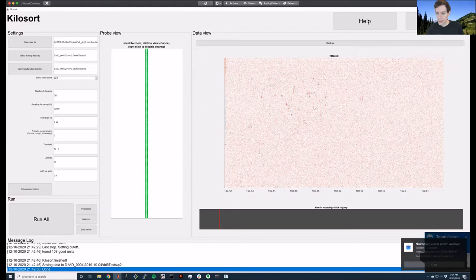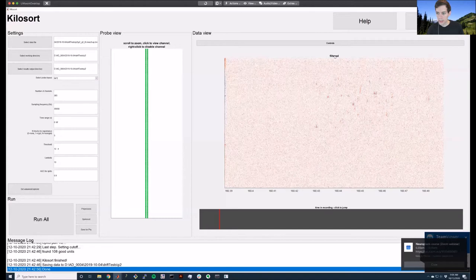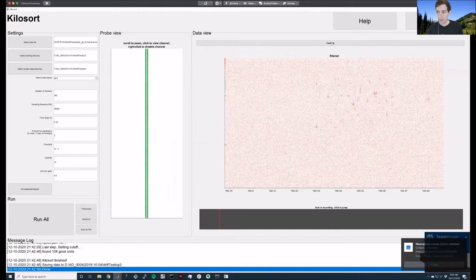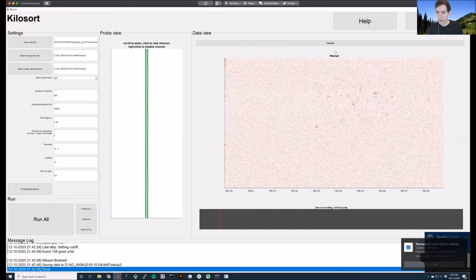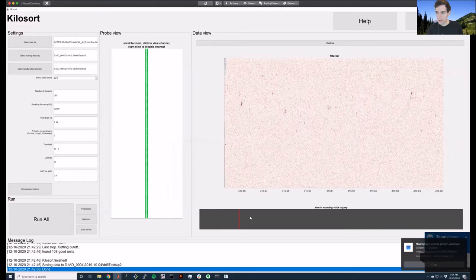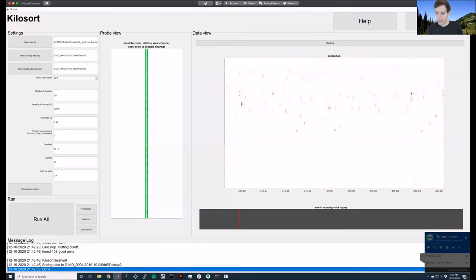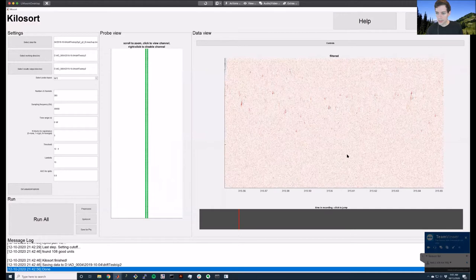You can switch back and forth between the raw data and the filtered data. From the filtered data you can see the prediction and the residual. As indicated in the controls, keys 1, 2, 3, 4 enable different data views: pressing 3 goes to prediction, pressing 2 goes back to the filter, pressing 4 goes to the residual. The bar at the bottom is a timeline — you can flip to different time points and check the residuals. You should be looking for flat, empty-looking residuals, and for the prediction to match the filtered data.